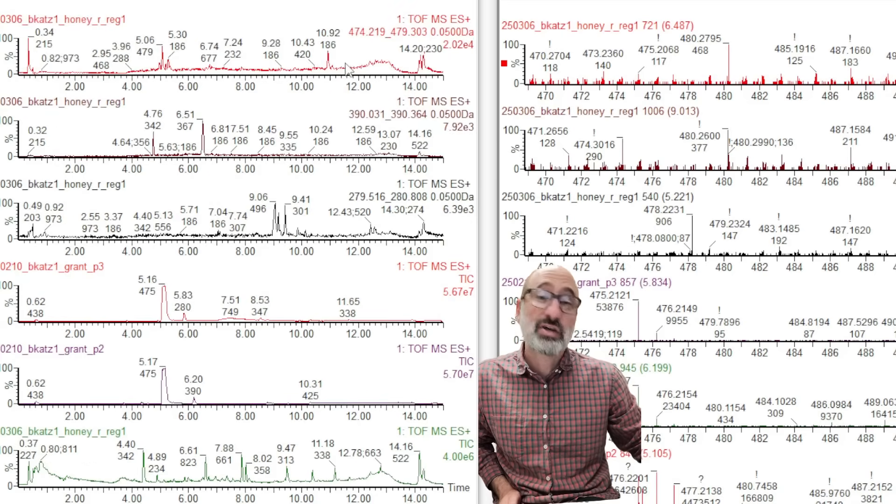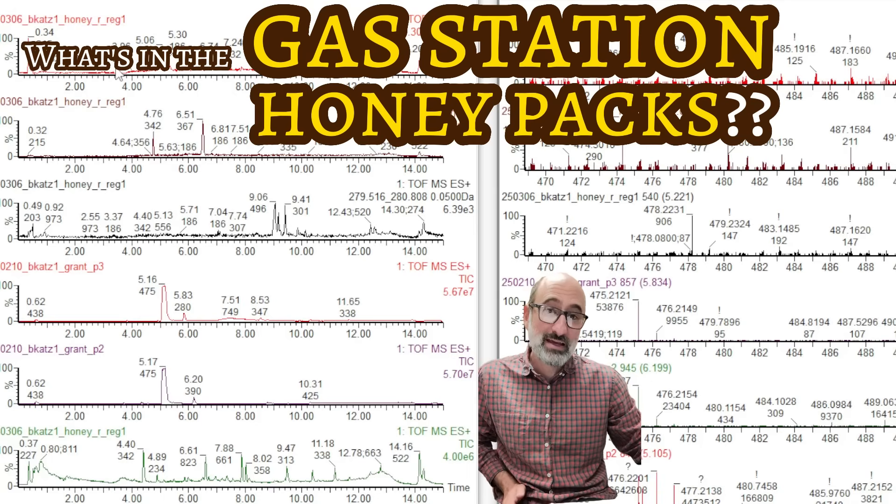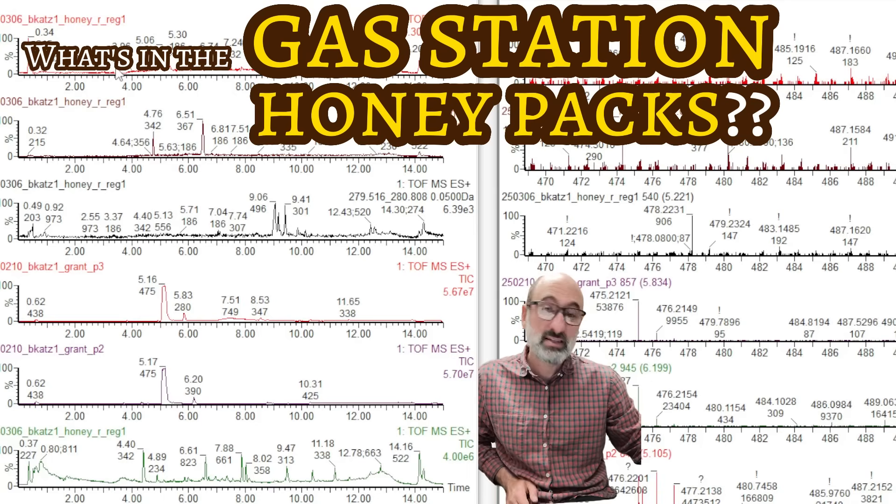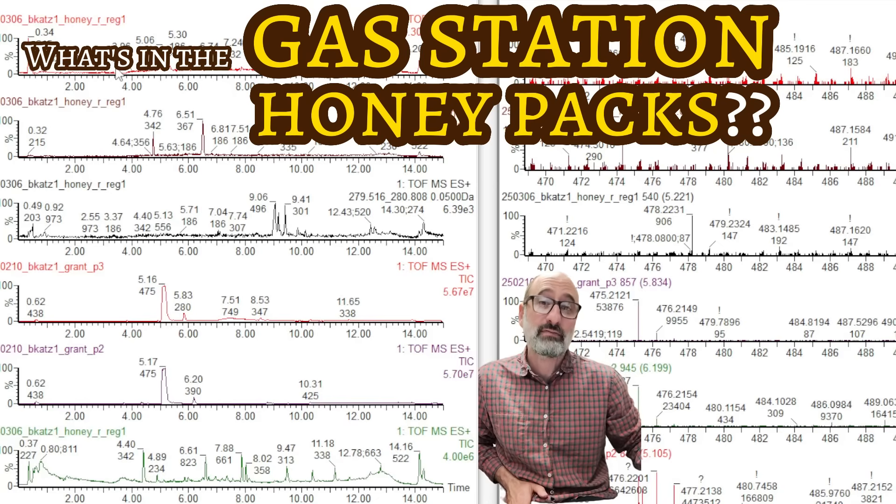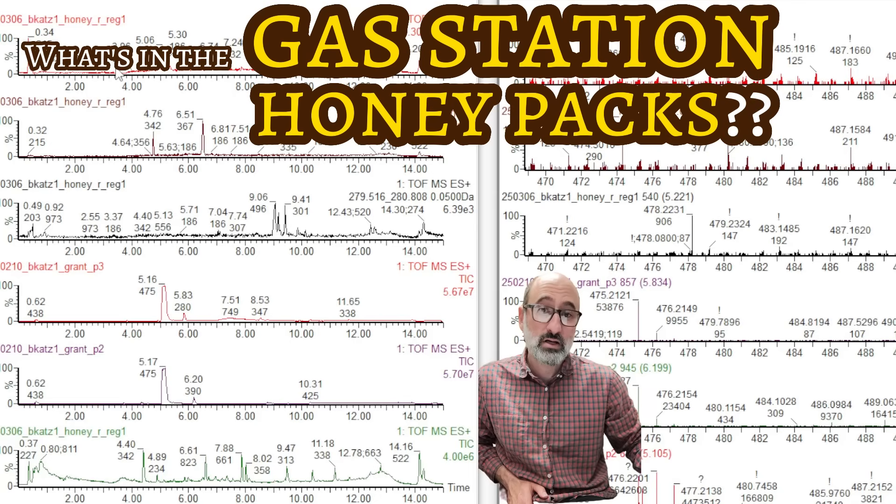Again, nothing. So, I can confirm that it maybe has got a little horny goat weed in there. It's potentially got some really scary codeine in there. But, it definitely does not have Viagra prescription ED medicine in there.